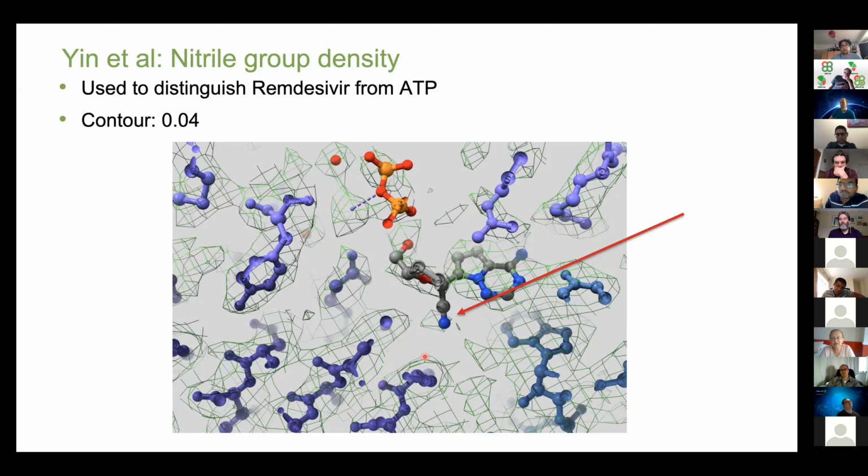But if you have some kind of not quite severe preference in the orientation, for example, if you have only end views, it's one story. But if you have side views, it's another story. How to deal with that? Yeah, but there's a plot that can show you that in a diagram. Alternatively, obviously, you look at the angle distribution. Okay, you have this plot, but the problem is how you are going to blame and how you can rectify the problem. Well, first you've got to identify it. So maybe the plot should be up there with validation. This issue in general, that's what in the future we have to discuss. It's an important issue.